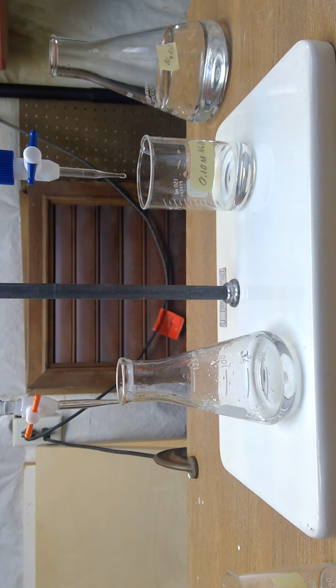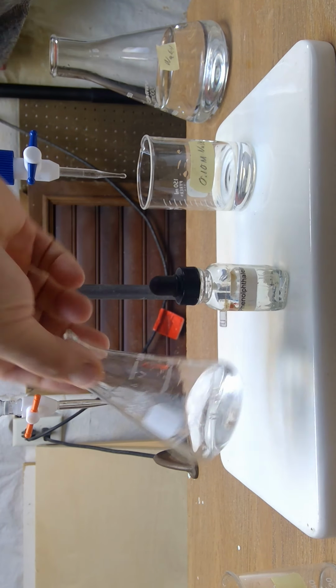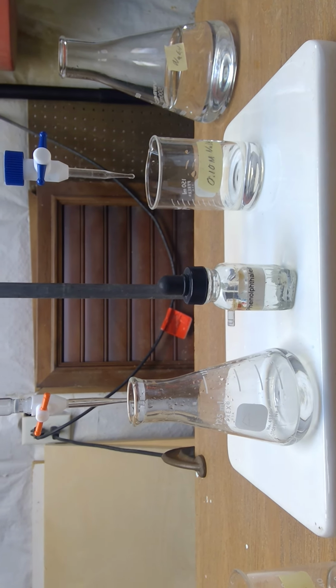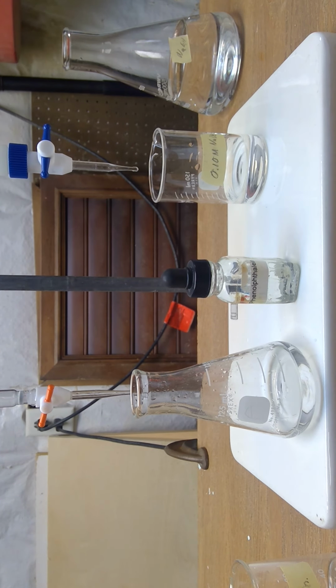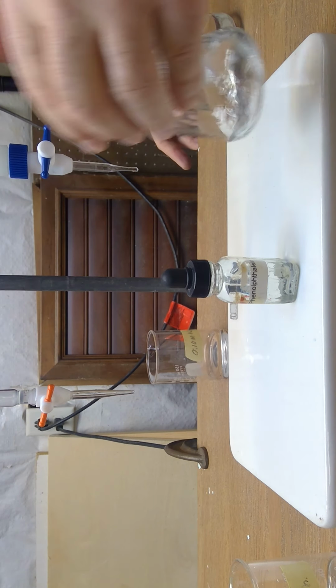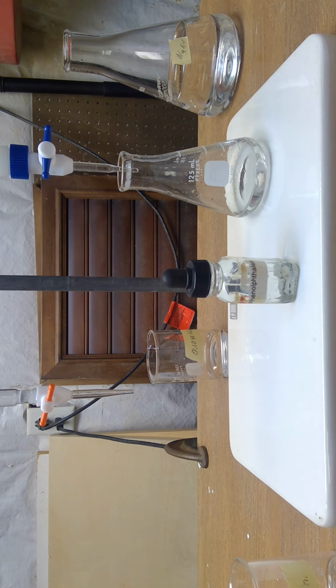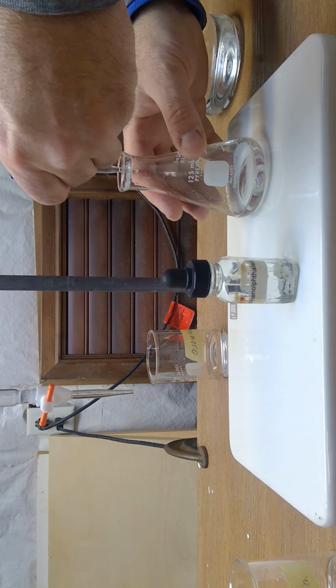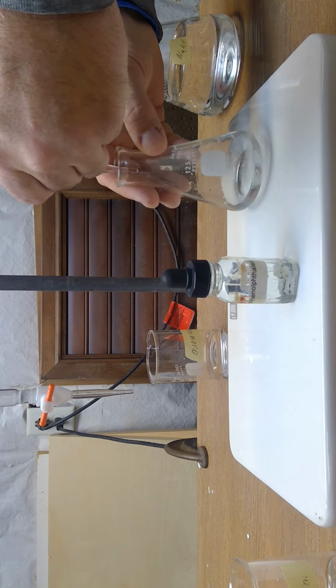So then we need some phenolphthalein, and below 8 phenolphthalein is clear. You only need 2 or 3 drops. Okay. And now we're going to start our titration. So I'm going to put this off to the side, and we're going to put this under here. Now, as you add your sodium hydroxide, let me check my 0 mark. I'm good. All right, as we add our sodium hydroxide, you want to swirl.